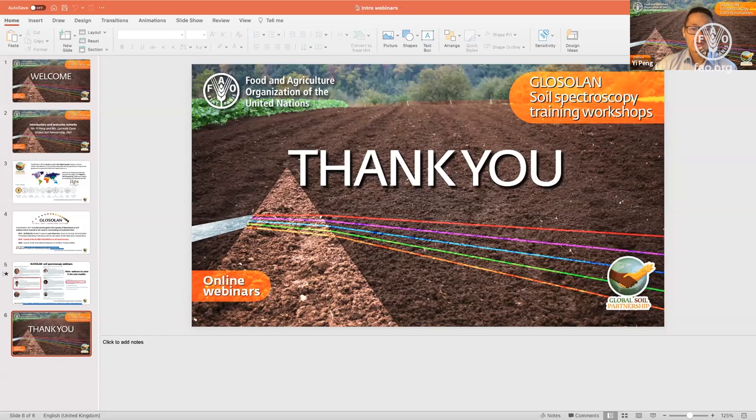He and his team were one of the first research groups who started to develop functions and packages for soil spectral data analysis using the R program. I remember the first time I started to use R for chemometrics modeling was in his team. They recently published a book, Soil Spectral Inference with R, which is a very good material to learn how to use R for soil spectral modeling.